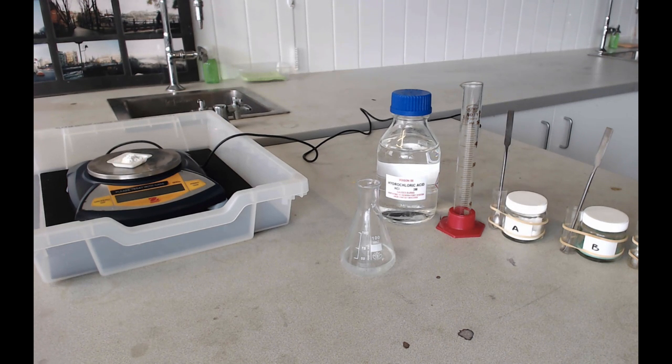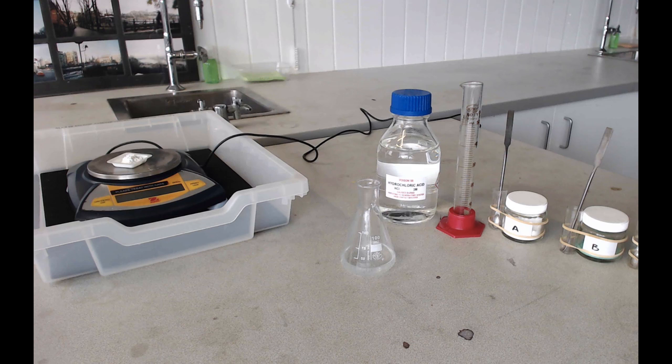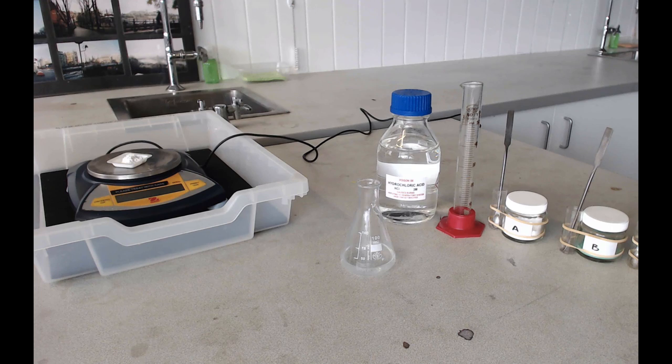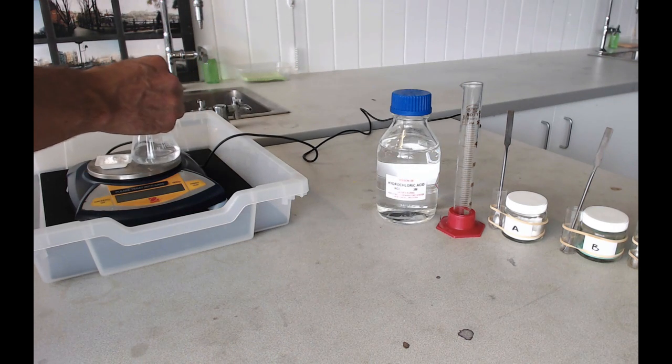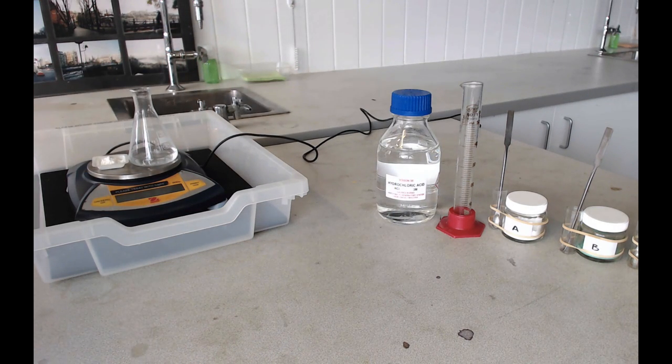Before you place your solid into your acid, it's important to know how much the solid and the acid weigh together, because what you're going to try and do here is see how much weight is lost when the solid reacts with the acid. The simplest way to do that is to place both of the things on the balance together and to record how much they weigh together.